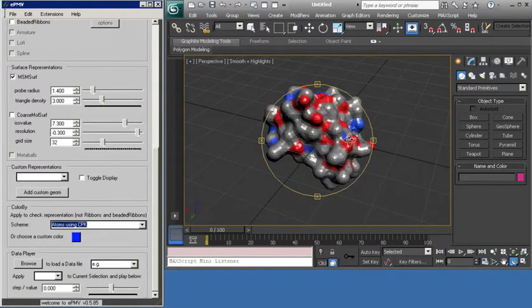Yeah, it'll look very similar to the original atoms that you clicked in terms of the color. We've got gray carbons, red oxygens, blue nitrogens, and the yellow sulfur that you can't see because it's inaccessible to the water molecules or to the probe radius atom. It's deeply buried there. And we can modify this.